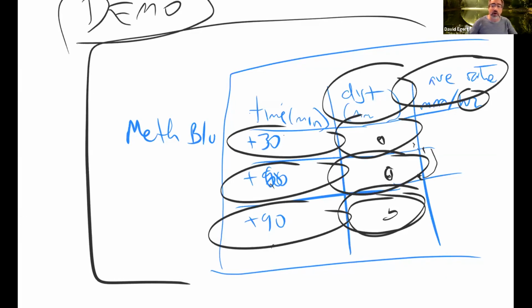There's no hypothesis or objective, but you should describe what this means. Compare the methylene blue to the potassium permanganate, what you saw and why it makes sense from the theoretical framework we've been talking about. So that all makes sense.